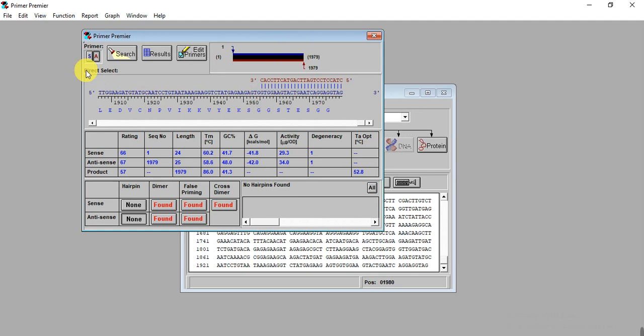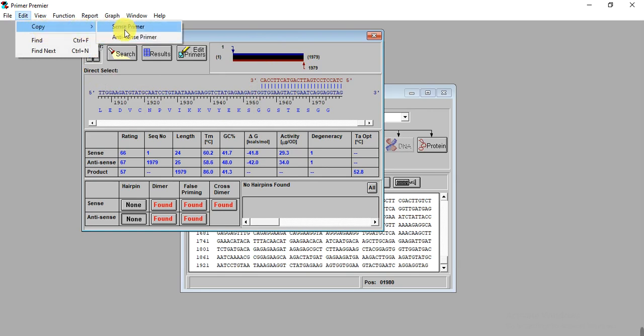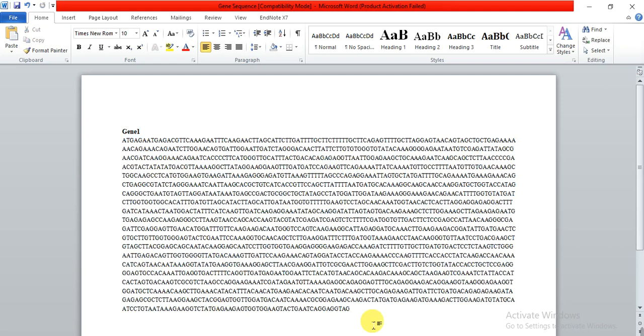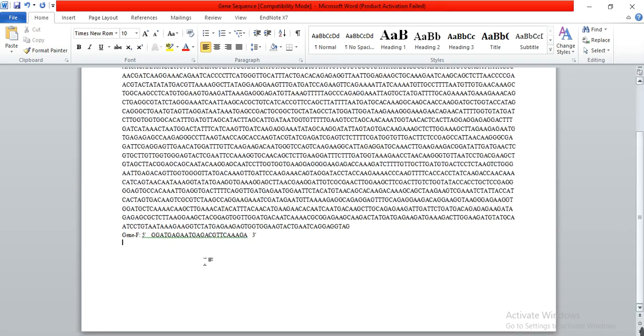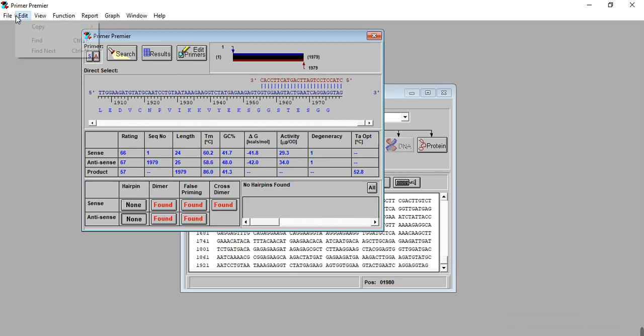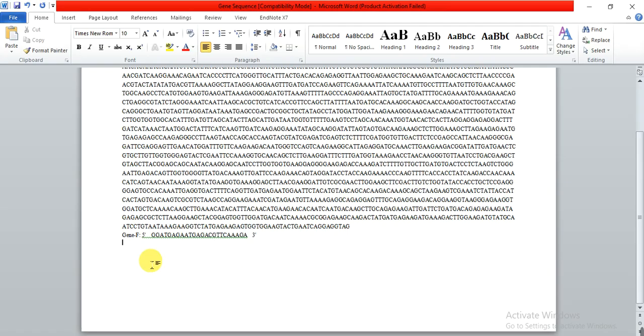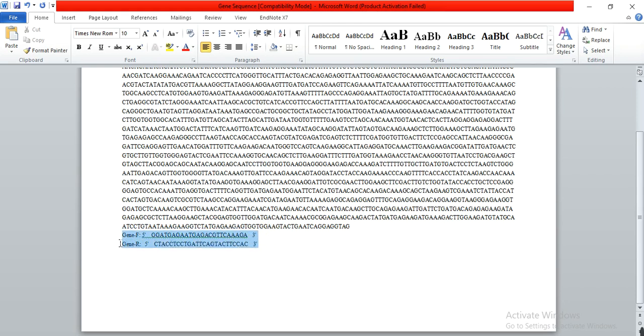Then you need to go to Edit, Copy. Here is the sense primer. Go to your file, name it like Gene Forward, then Ctrl+V. Then Edit, Copy antisense. Name it Gene Reverse and Ctrl+V. It has pasted your forward and reverse primer. Then you can send these primers to the company. The company will synthesize these primers and send them to you, and you can use them for cloning your gene.